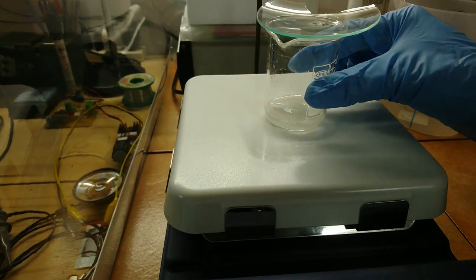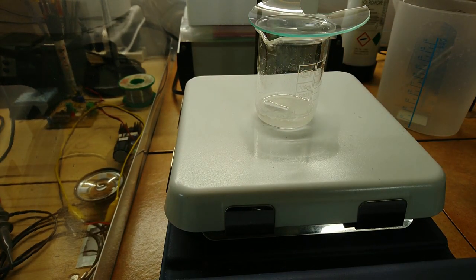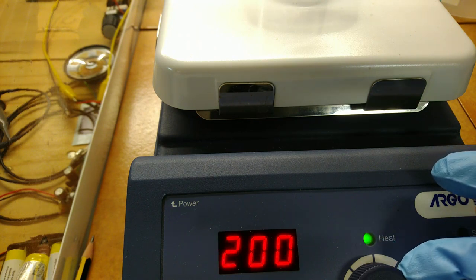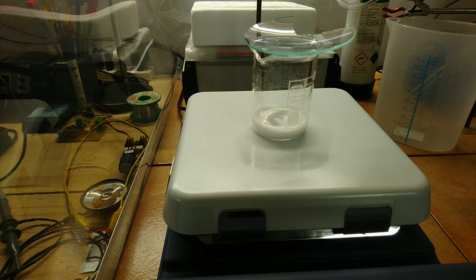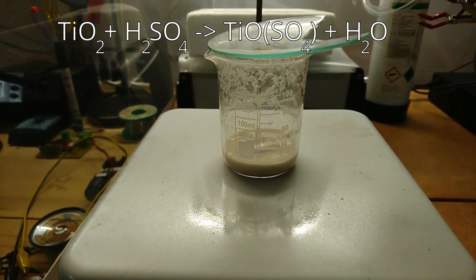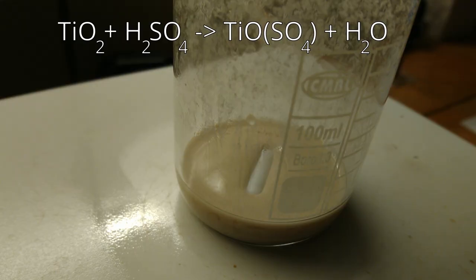It is now time to add the secret ingredient for this reaction: time. Heat and stir the mixture for a total of 33 hours at 200°C hot plate temperature. I actually turned off the hot plate during the night for safety reasons, and the reaction still worked, although it needed even more time.